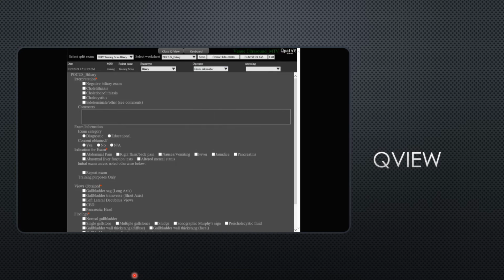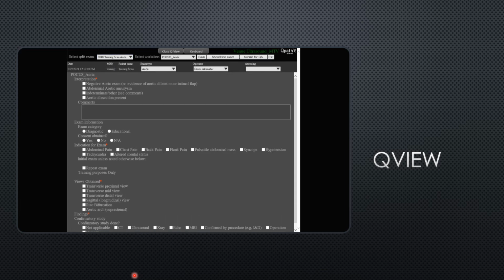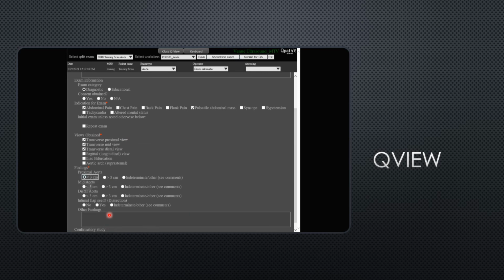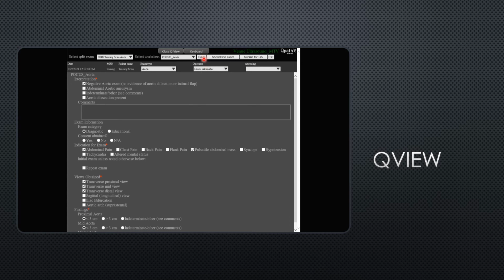As you just see, it's the exact same process on each one. Now we're going to come back to this, and I'm going to fill out the worksheet. You just tap it. If you need to put free text in a field, then you would click this keyboard button first and then select the box that you need. Once you get all the way down to the bottom and you filled it all out, you can click the save button. There's also a save button down at the bottom as well.